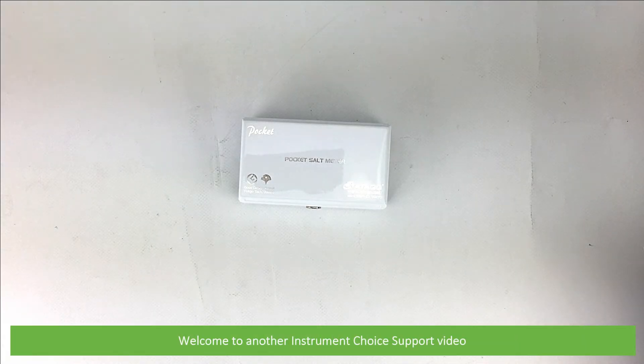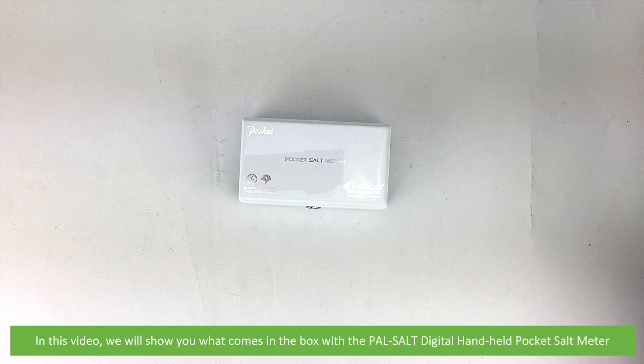Hi and welcome to another Instrument Choice support video. In this video we'll show you what comes in the box with the PALSALT Digital Handheld Pocket Salt Meter.